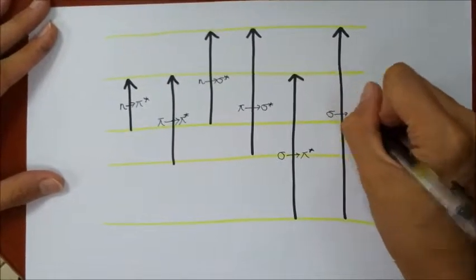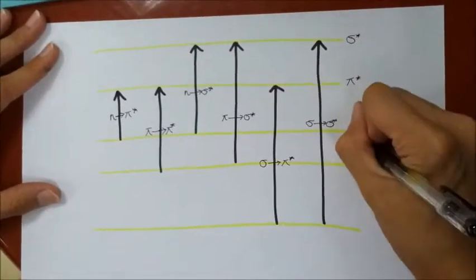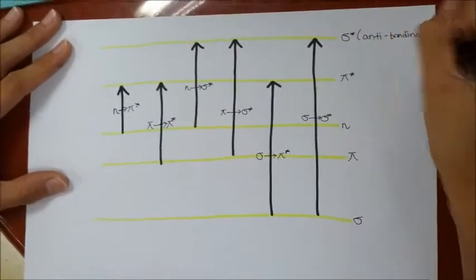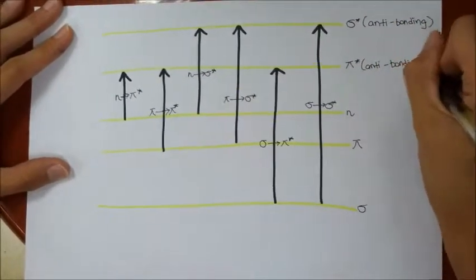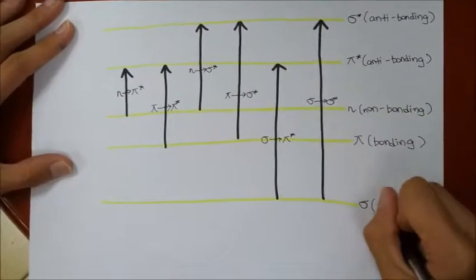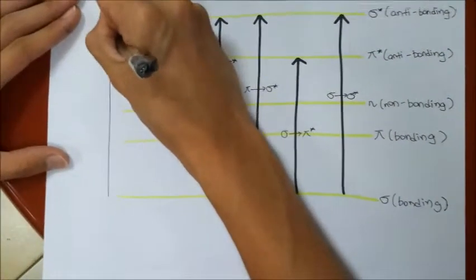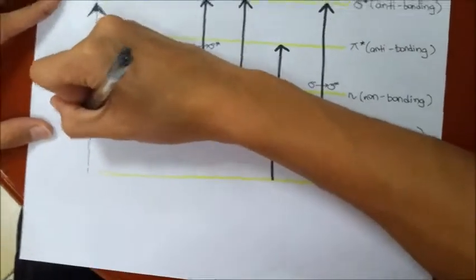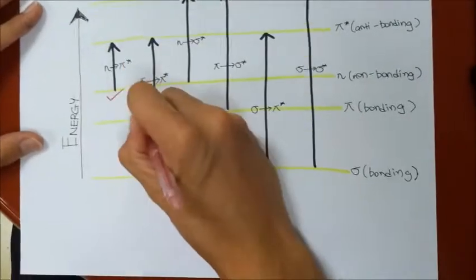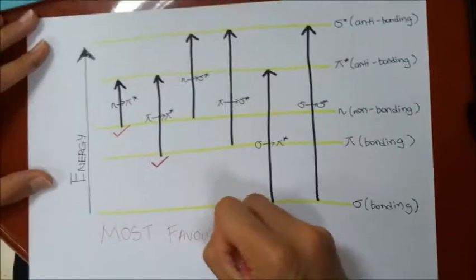As a rule, energetically favored electron promotion will be from the highest occupied molecular orbital to the lowest unoccupied molecular orbital, and the resulting species is called an excited state. When sample molecules are exposed to light having an energy that matches a possible electronic transition within the molecule, some of the light energy will be absorbed as the electron is promoted to a higher energy orbital. An optical spectrometer records the wavelength at which absorption occurs, together with the degree of absorption at each wavelength.